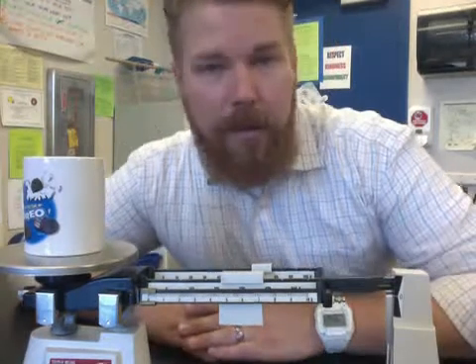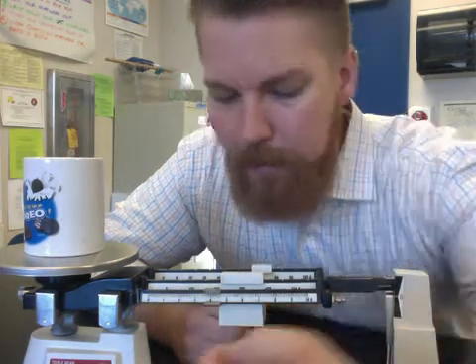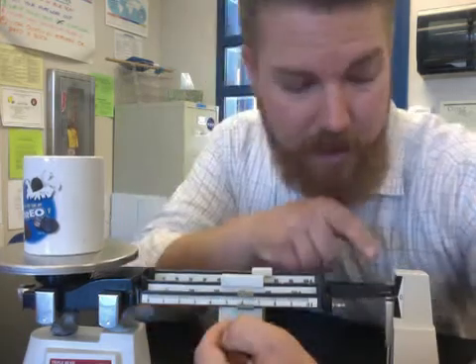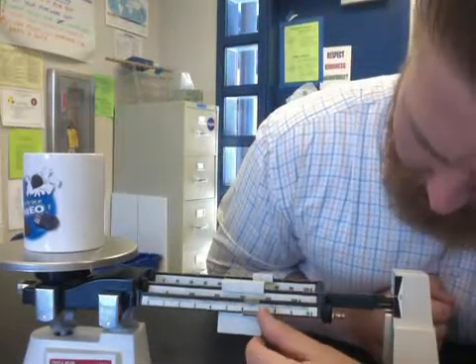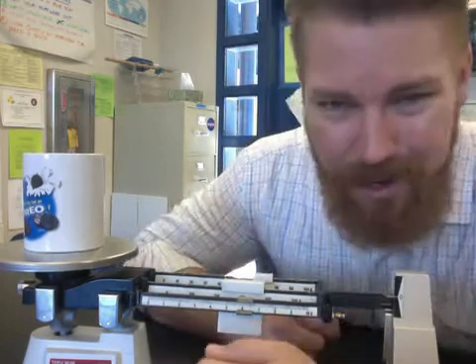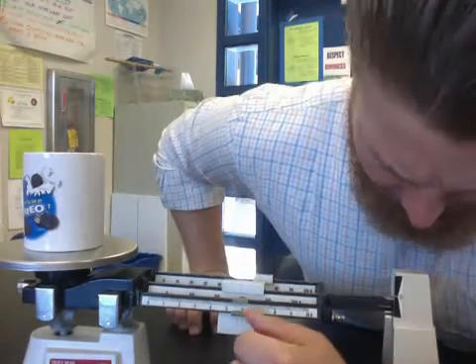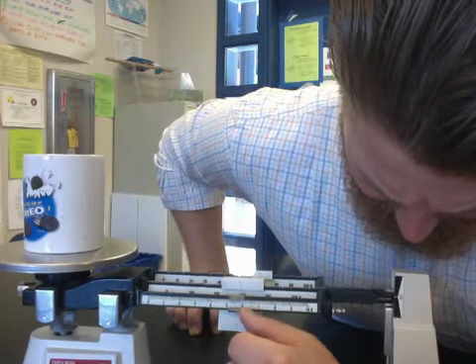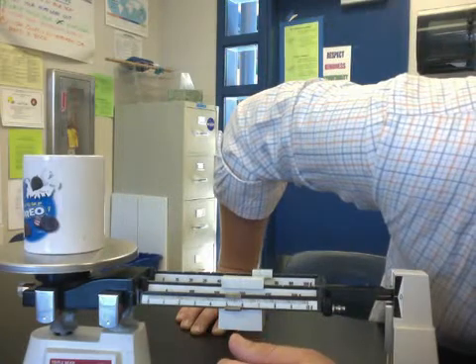Now the last one — the 1-gram weight. This one has no notches. You're just going to slide it over until the arm is perfectly balanced and the lines match up. Sometimes I like to use a pencil to do this because my fingers get in the way — a pencil allows me to be more precise. Almost there — all right, now let's read this thing. The lines are matched up.